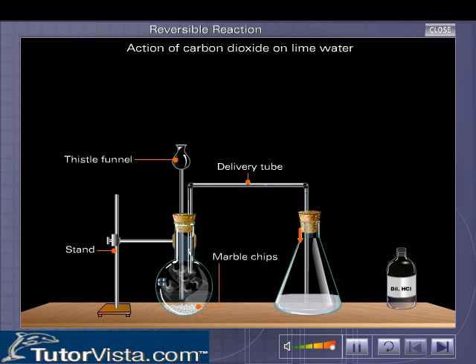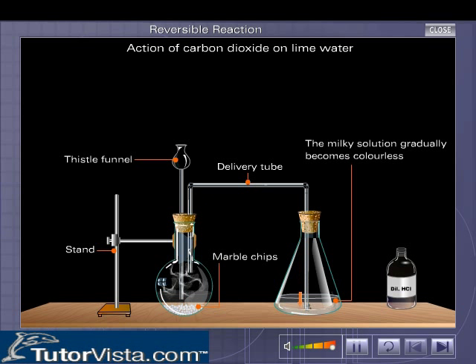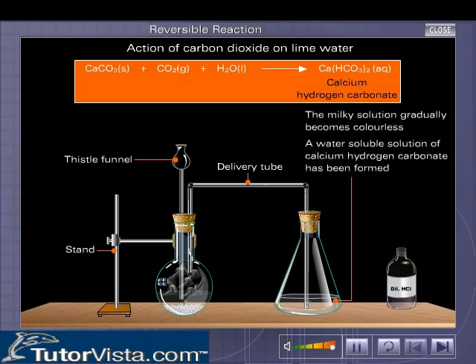On passing the gas for a longer period, the milky solution gradually becomes colorless. This is because a water-soluble solution of calcium hydrogen carbonate has been formed.